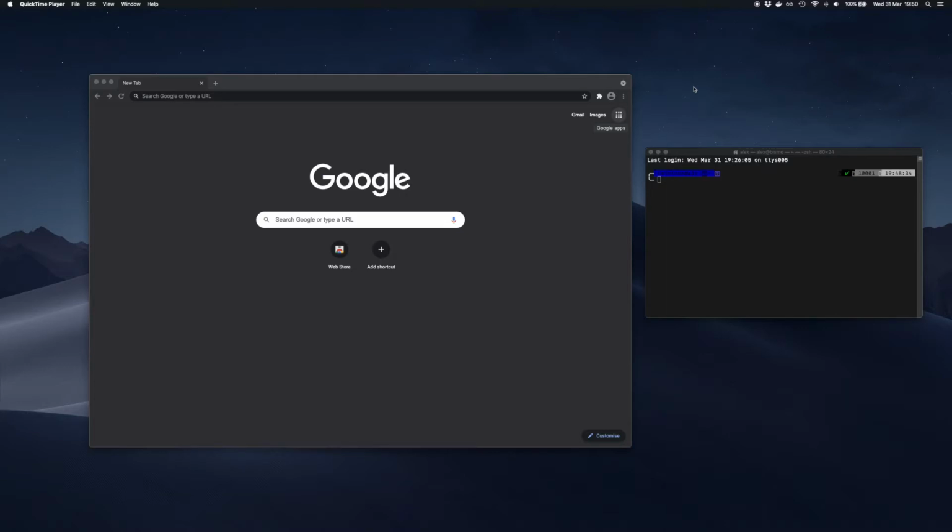features of Thunor Web. I've previously done a quick 3-minute overview video, so I will link to that if you just want to see what Thunor Web is about, first of all.